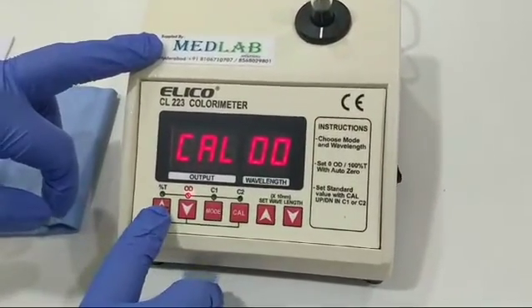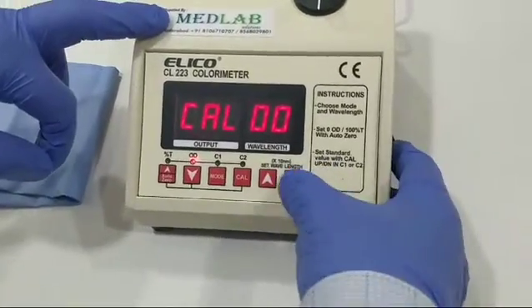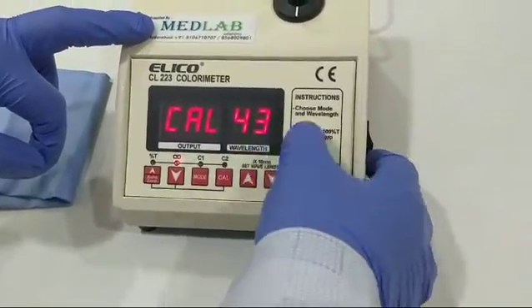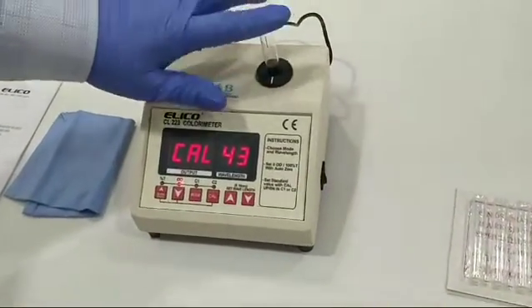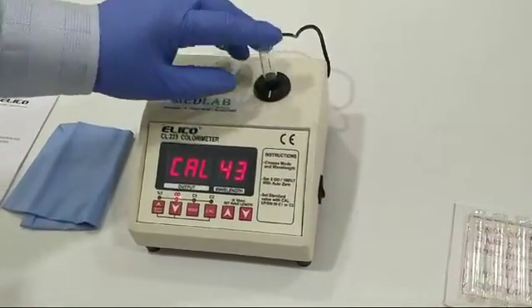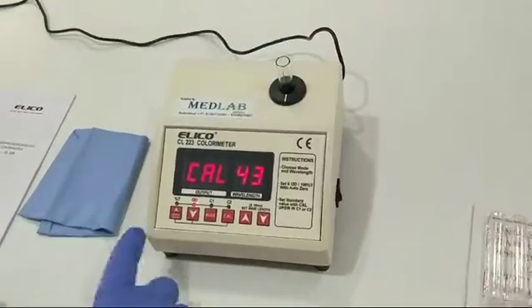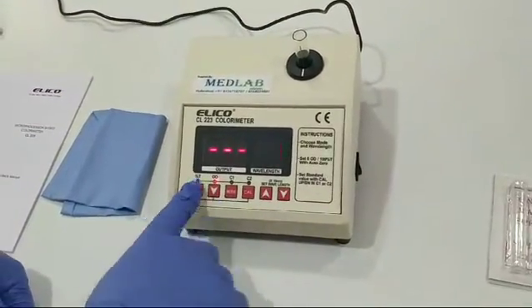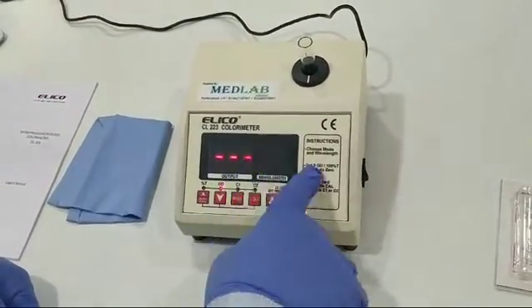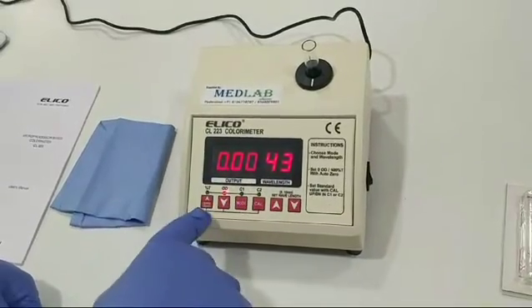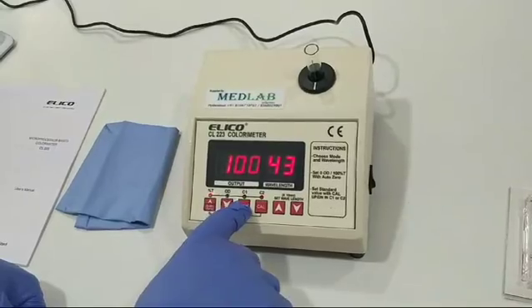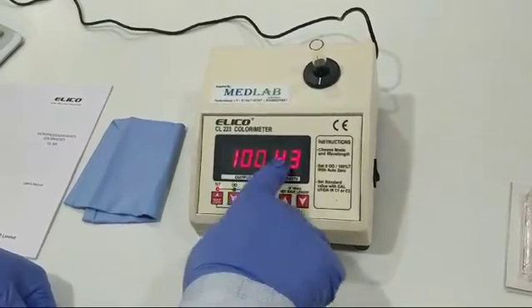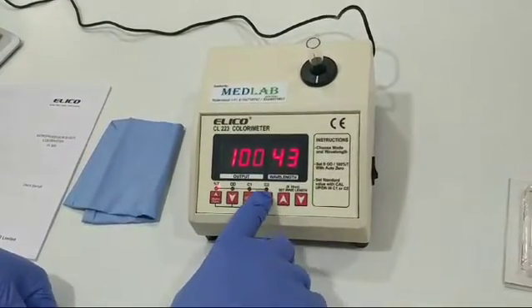Once you have selected the wavelength, suppose you select 430nm, you will insert water into the cuvette. After inserting, you will press auto zero. For 430nm wavelength, the OD will become zero and the transmission will be 100%.